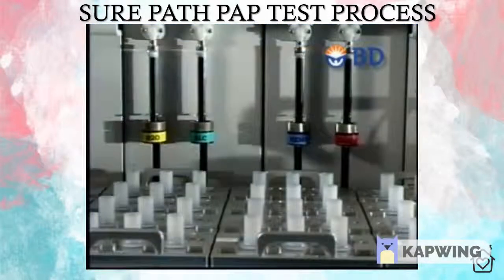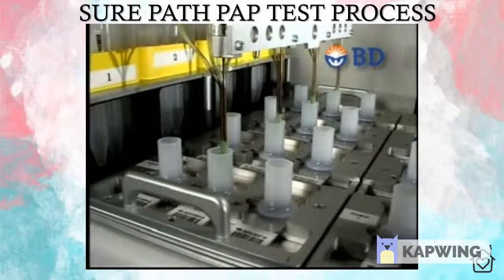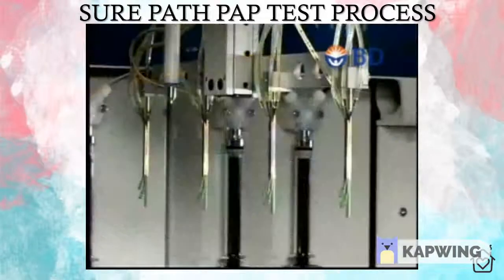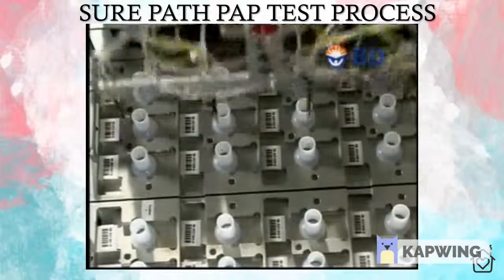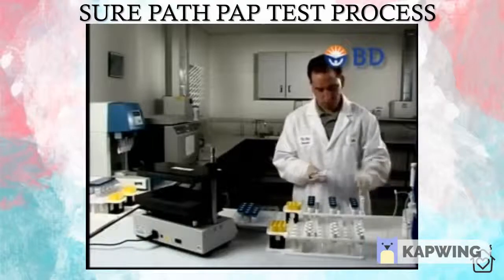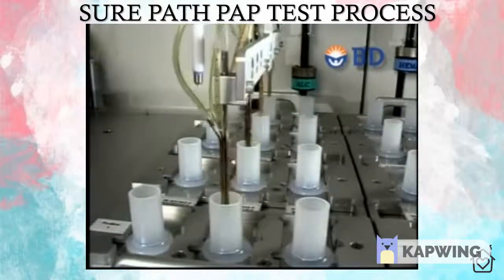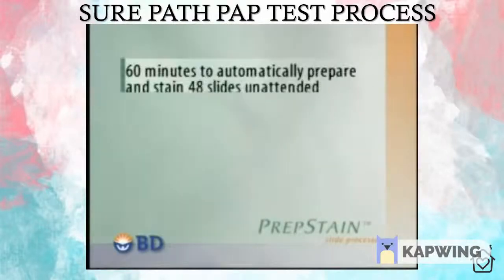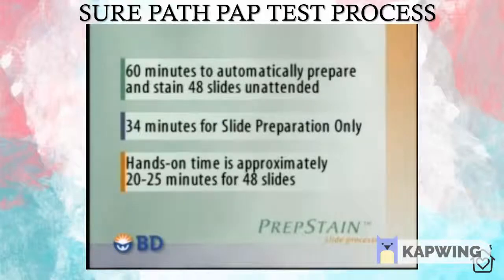If the staining option is selected, the PrepStain slide processor proceeds with discrete staining that includes all the common steps involved in a progressive Pap stain. Standardized discrete staining eliminates another variable from the preparation process. Stain intensity and tint remain consistent, and the stain never needs to be filtered or reused. Stain bundles have four tubes to dispense the staining reagents as appropriate. The longest tip is the aspiration tube, which vacuums excess waste and stain into the waste container. The system provides an audible alert upon specimen completion, freeing the technician to do other things while the automated PrepStain processes slides. The PrepStain system takes about 60 minutes to automatically prepare and stain 48 slides unattended, or 34 minutes using slide preparation only. Hands-on time to complete the preprocessing steps is approximately 20 to 25 minutes for 48 slides.